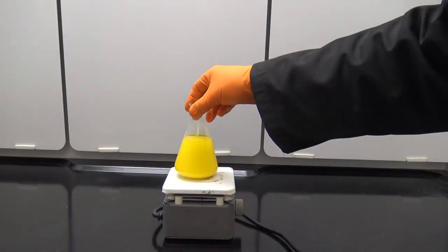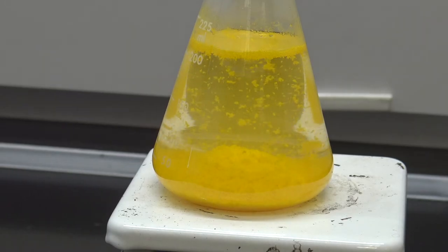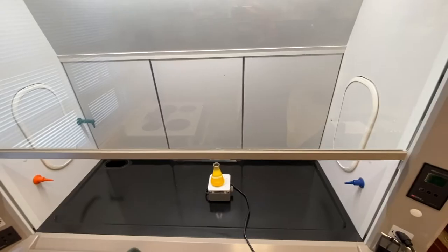So we mixed two aqueous solutions and made a solid that we can see. Now, I told you we were gonna make a snow globe, so to turn this into my special toxic snow globe we're gonna heat it up so that when it cools down it recrystallizes. We'll leave it on the hot plate for a little while in the fume hood so we don't want any of these fumes coming into the lab.